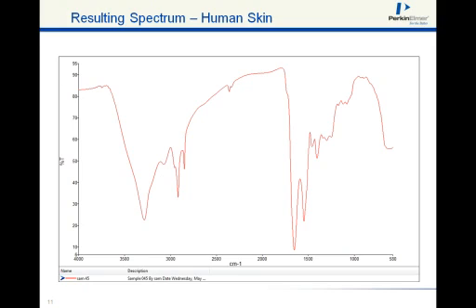And anybody that's ever done infrared microspectroscopy should know what this is. This is the most common contaminant in infrared microspectroscopy. This is the spectrum of skin. It looks a lot like the previous slide of nylon, and it sort of is and it sort of isn't. But that's a very, very common and very, very easy sample to run.